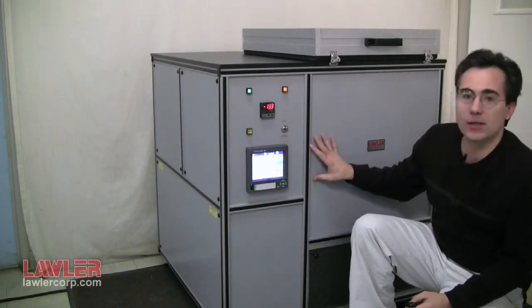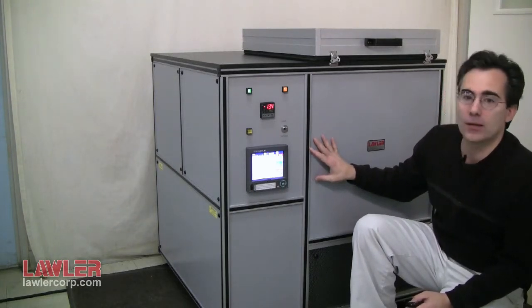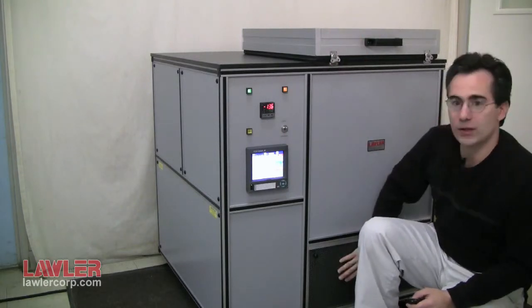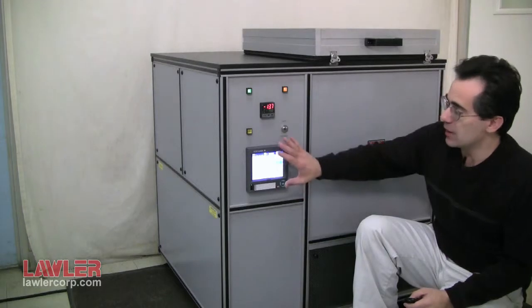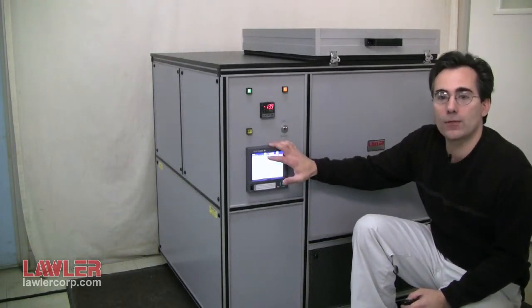Hello. The instrument behind me is the Lawler Low Temperature Torque Tester — the single position model. It features the air chamber itself. The lower deck has the refrigeration compressors and assembly. There is a digital paperless video graphic chart recorder for logging of the load cell and the bath temperature.